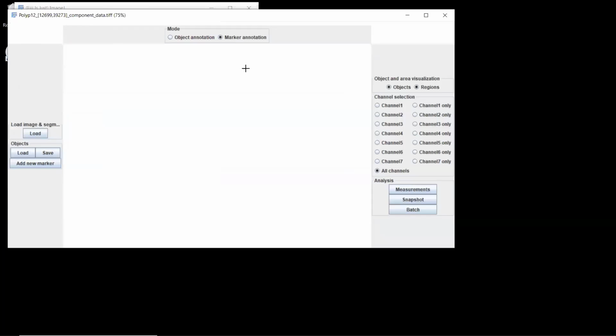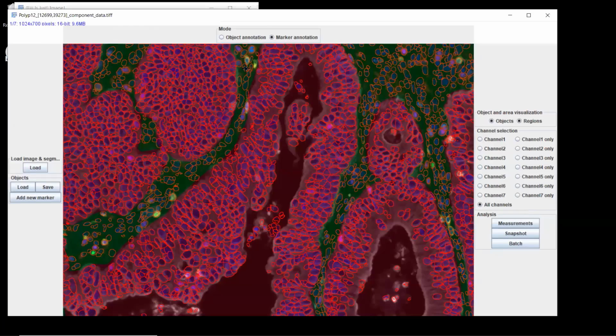All right, and let's go back to the marker annotation. I'm going to take my drawing tablet again. All right. So now let's say that you want to identify markers. There are 3 ways to do it: a manual way, a segmentation way using thresholding, and a logistic regression.